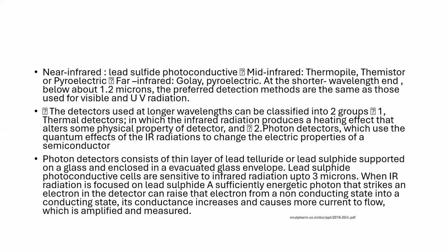Now, these are the details about near infrared and far infrared. What kind of detectors will you use? For near infrared, lead sulfide photoconductive system is used.